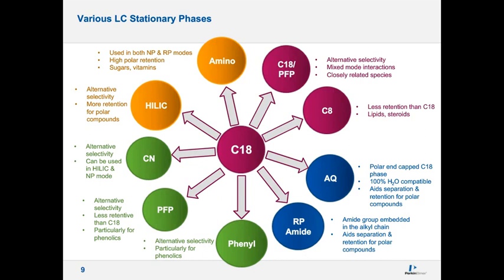Cyano phases will allow pi-pi interaction, moderate hydrophobic interaction, and the strong dipole of the cyano group facilitates dipole interactions with polar solutes. The phase offers decreased retention for hydrophobic compounds in comparison with standard alkyl-bonded phases due to reduced hydrophobic character. Cyano phases are often used for improving polar compound separation and can be used in both reverse phase and normal phase chromatography due to their intermediate polarity.